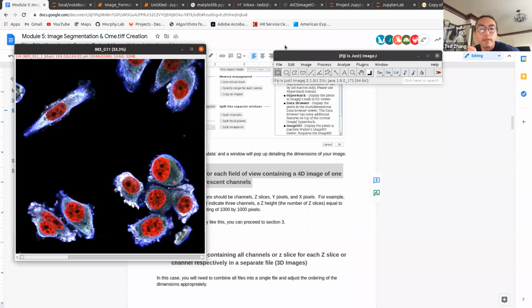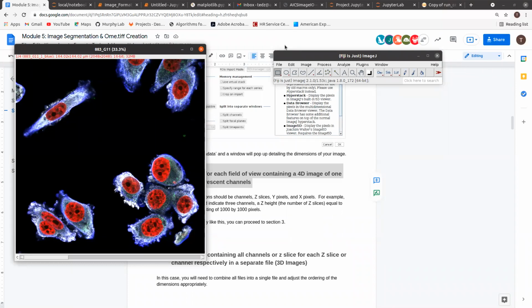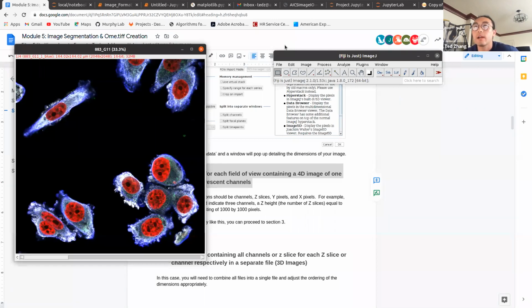Oh, so that's a segmentation. So for the model, that's after you process your images through CellOrganizer. Right now, what we're doing is just taking... Sorry, I meant I have a segmented image, and what I'm talking about is the segmentation model. It's a .model MATLAB file format, and I was wondering if I can use it or what the format must be. So for the segmented mask, you can have it as an OME TIFF. That's the preferred format.